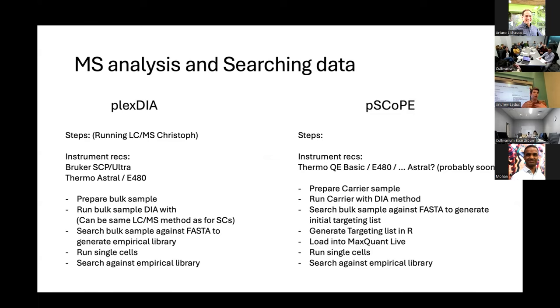And so you have what they call reporter ions, and they measure different relative percentages. If the majority of the sample came from one sample, that tag would obviously have the highest peak relative to the other samples. So that's one method of multiplexing with this sequential sequencing. Traditionally it was done with DDA.